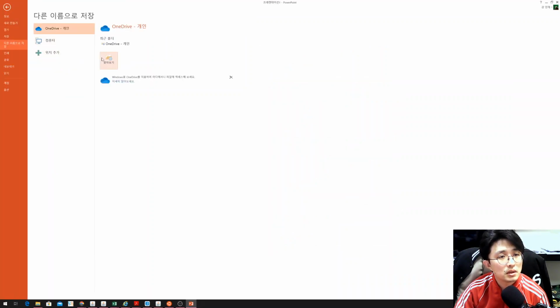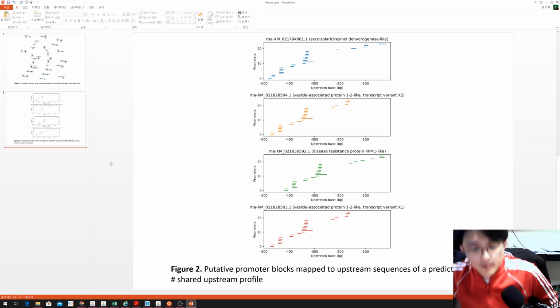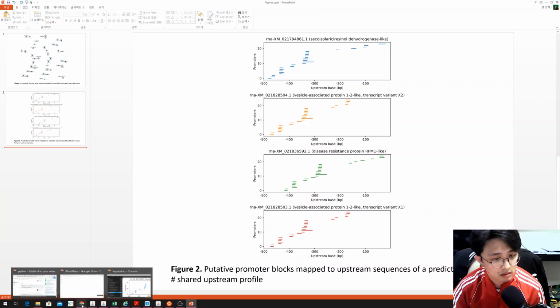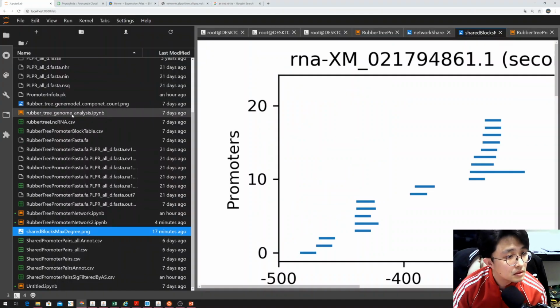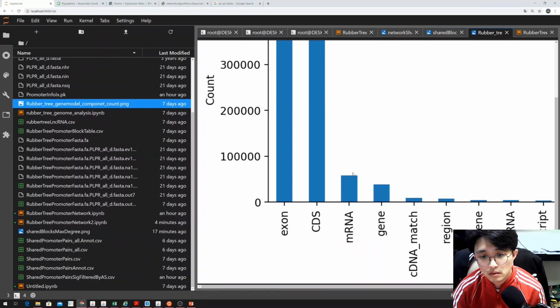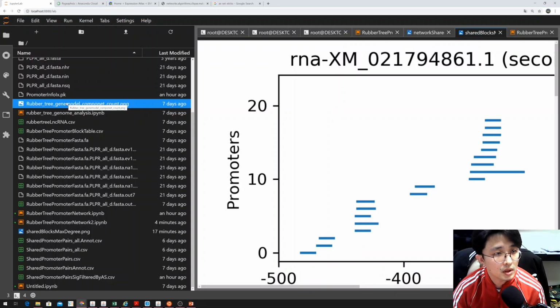Let me save it. So I saved. And let me see another. This is not informative.